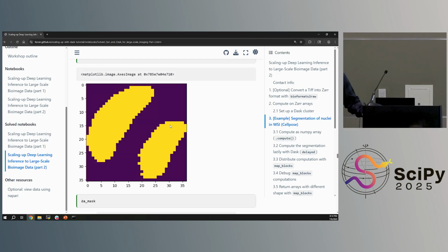Yeah, no, I can skip that running part. I was just trying to make sure that everything ran on the Napari, and it's a lot faster, so it's good. I was testing that just before, and it worked. So I didn't know that. That's why I did it multiple times, but I had to kill the kernel and restart from scratch, which is really annoying, because you lose everything, right? Then you have to go through everything one more time.